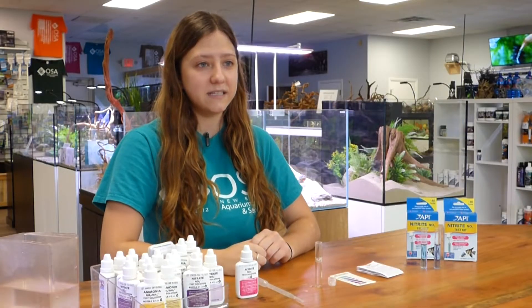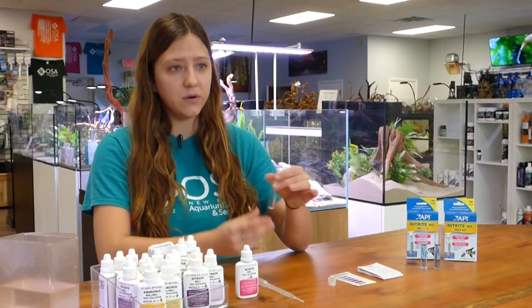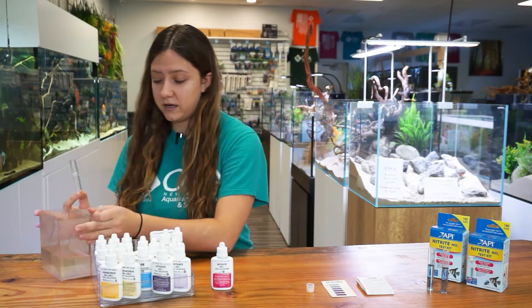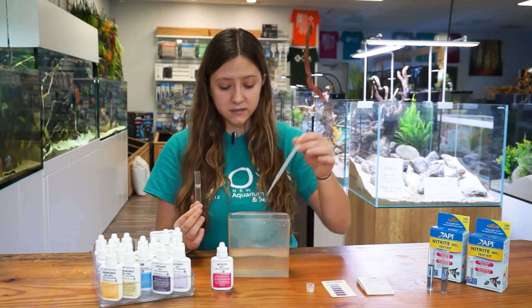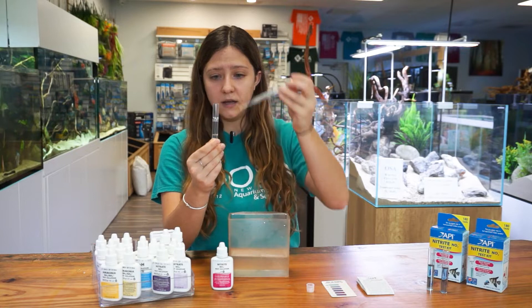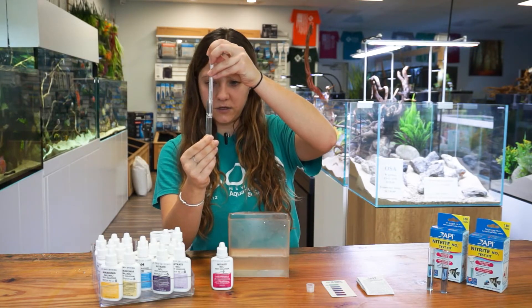Before doing any testing, I do recommend reading the instructions before you begin. So you're going to take your 5 milliliter test tube — here is some water that I pulled from one of our tanks. We use a pipette here to properly fill to the correct line, and you're just going to fill your test tube up with water up until you reach the line.